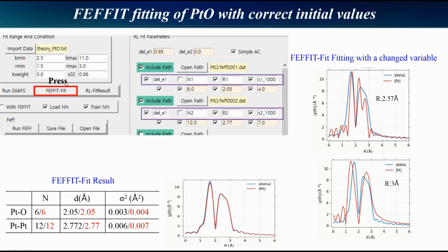The theoretical paths used to create the mimic platinum oxide were also imported for fitting.